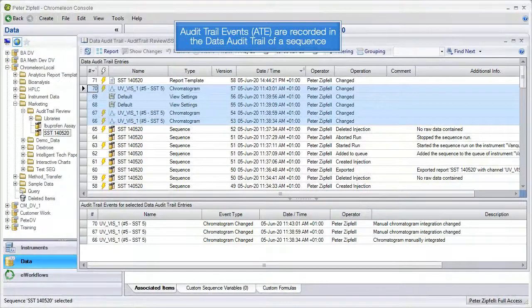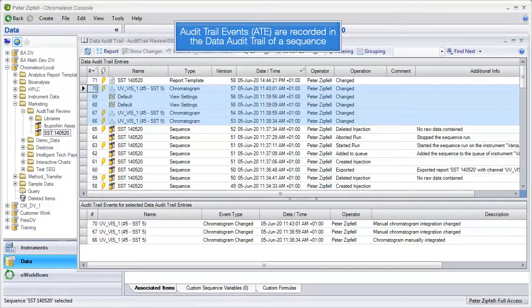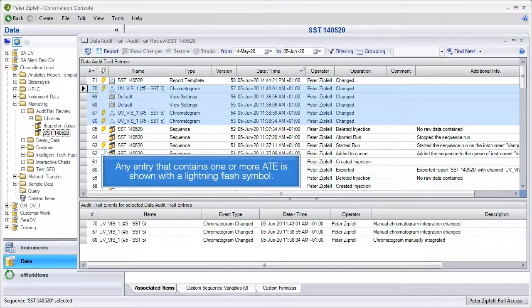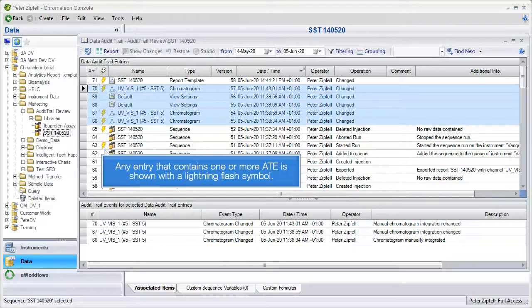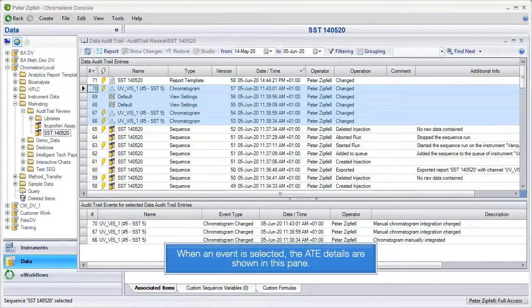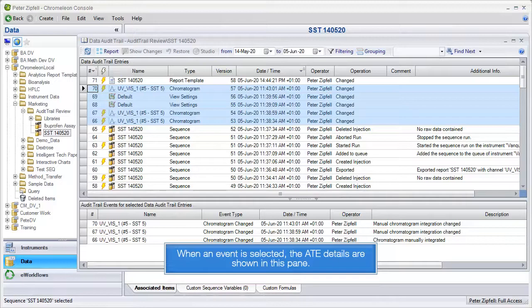Audit trail events are recorded in the data audit trail of a sequence. Any entry that contains one or more ATE is shown with a lightning flash symbol. When an event is selected, the ATE details are shown in this pane.